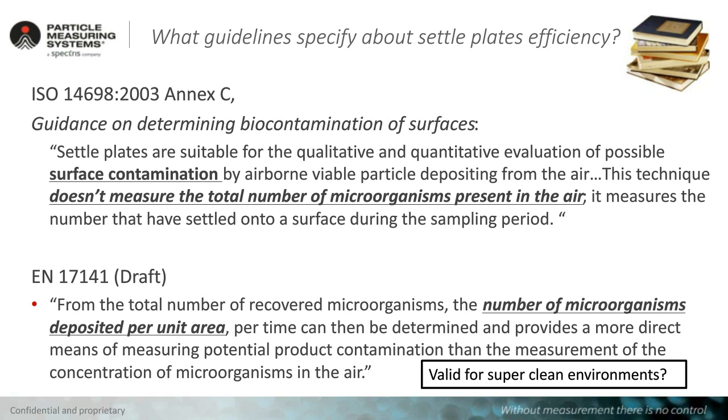The same is mentioned in a very new draft of the European side. Europe has developed its own new standard out of the 14698. Generally speaking, ISO 14698 should have been updated, but finally the ISO committee was not able to get aligned, so the Europeans developed a new standard, the European standard 17141, which is in a draft stage, but in the final draft stage.